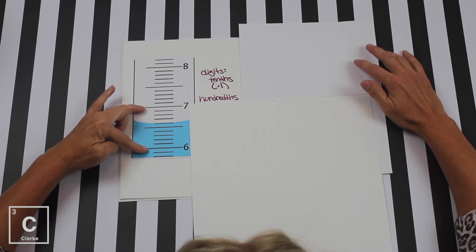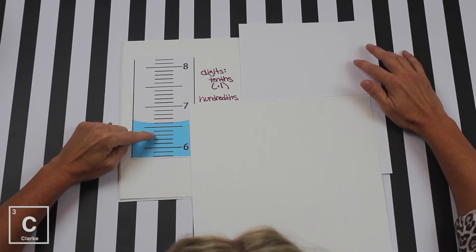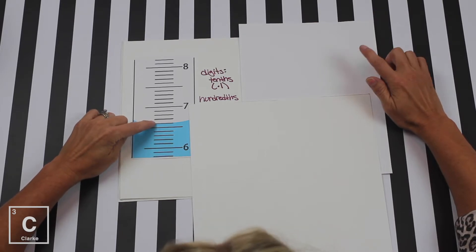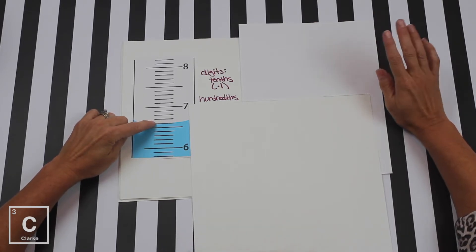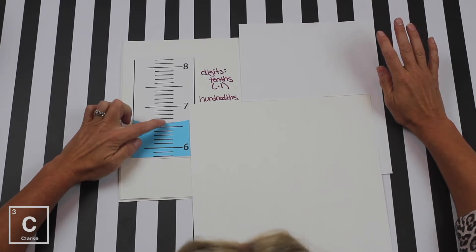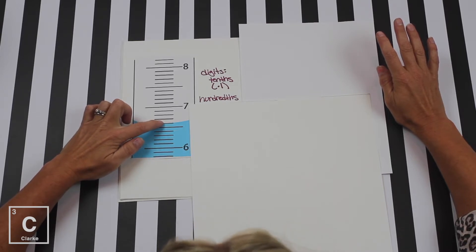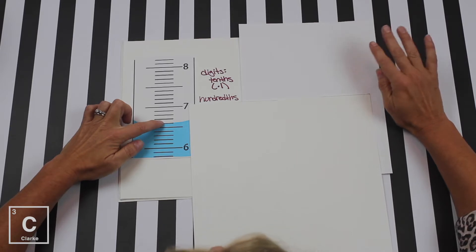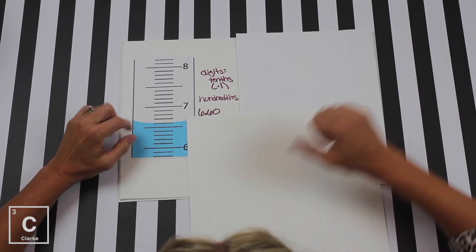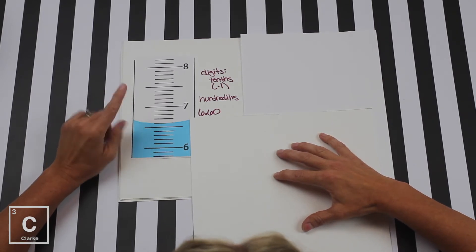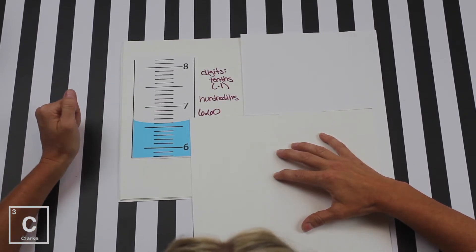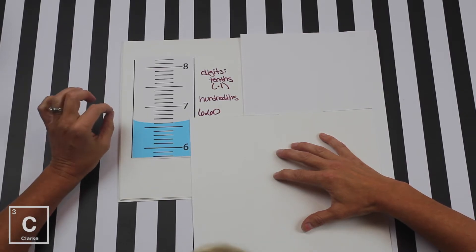So let's look at that. We've got 6 and 7. So 6.1, 6.2, 6.3, 6.4, 6.5, 6.6. That takes us to the tenth spot. We've got to estimate that last digit. And since our water line, the bottom of our meniscus, is right on the 6, we're going to estimate that digit as a zero because it is right on. So we're going to say our answer for this is 6.60. Now I didn't include a unit because we're not for sure what this is measuring in, but most of the time graduated cylinders measure in milliliters. That is how we measure using sig figs. Measure to the full extent of your piece of equipment plus one digit.